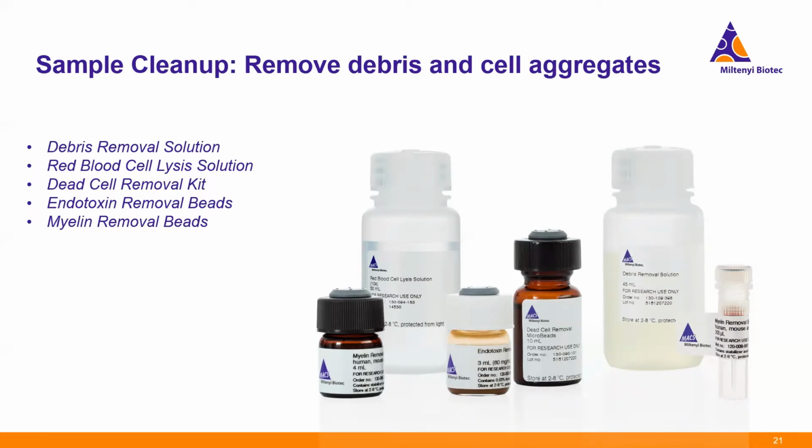And having these reagents as part of your sample prep workflow is really critical because filters won't be effective in removing some of these smaller contents. And it goes without saying, especially that you want to remove dead and dying cells, as well as red blood cells from your samples, because these can significantly impact the quality of your sequencing data later on.